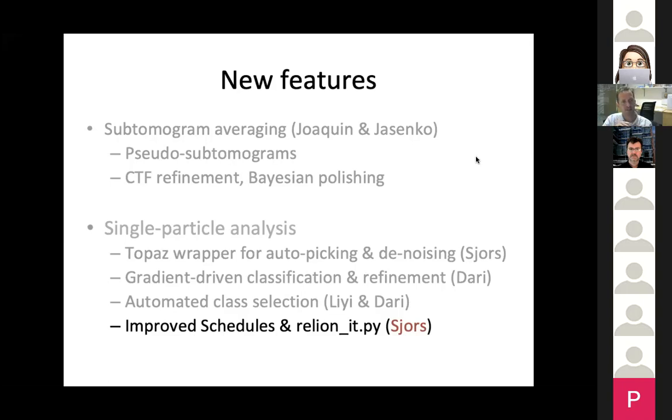The schemes are basically a framework where you can organize a whole set of jobs to be executed automatically, and the framework itself can take decisions. So based on parameter values in the script, which change as the process goes along, you can decide to go into one branch of a graph or another one.